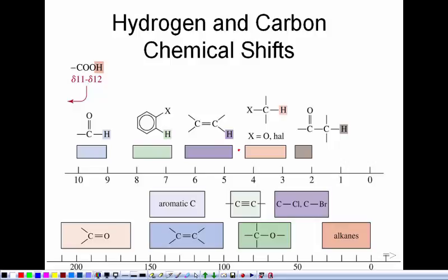Okay, so we're really going to need all the pieces of information put together to figure out what the structure is. We're just going to touch upon the techniques that people use, but it's possible to take a molecule that has 20 carbons, take the assignments of all the protons and the carbons and figure out the structure.